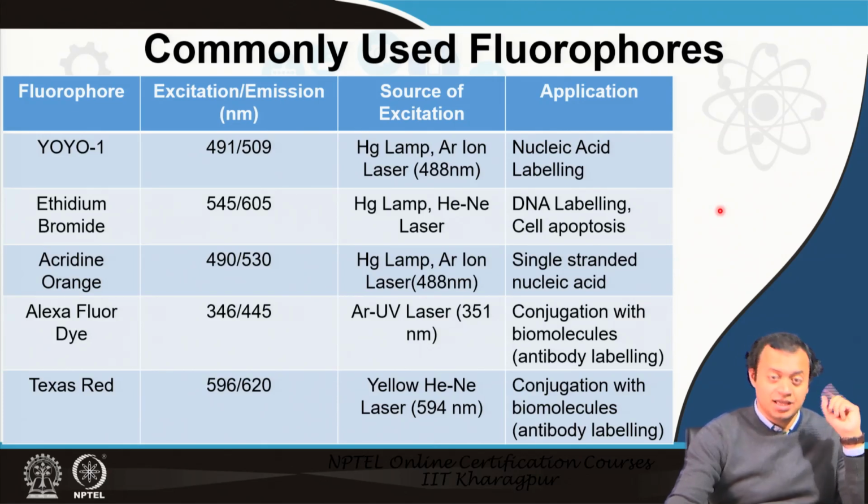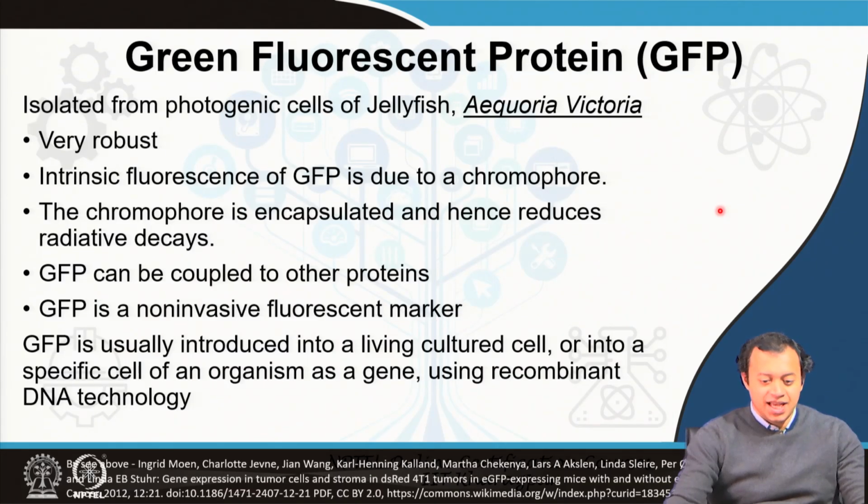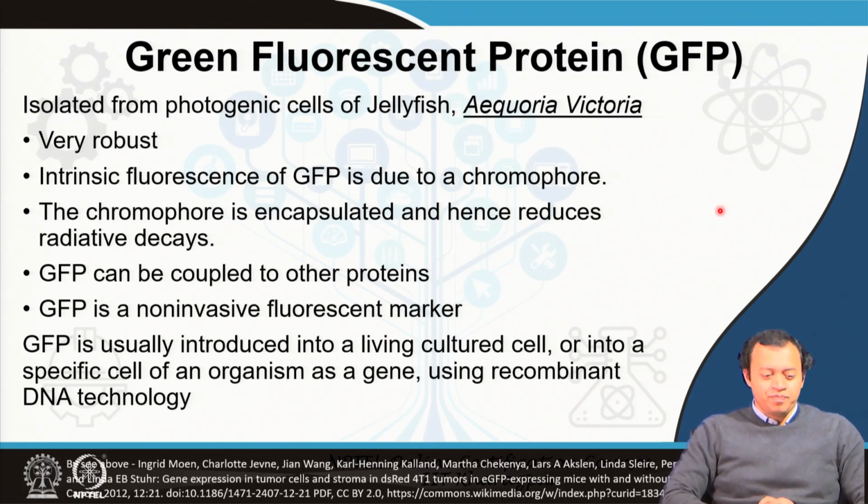I am itching to show you something uber cool, and that is GFP, green fluorescence protein. This has revolutionized fluorescence microscopy when it comes to biological matter, and this is uber cool. This is so cool, I cannot even try to explain it to you.